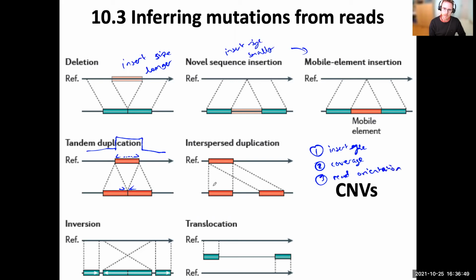If we look at this example, if we've a merging of these different reads, some reads will map from here inside to this segment here. So that means the read will map from here all the way around to that one there. And vice versa, reads mapping from here over to this side will map from here all the way down to here, indicating that something dramatic has changed.